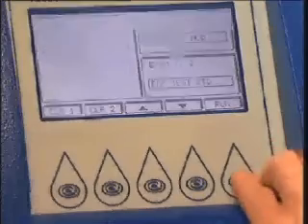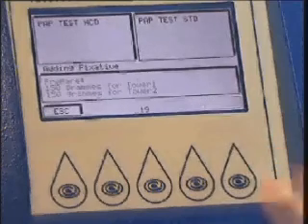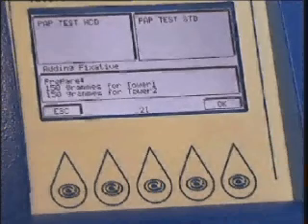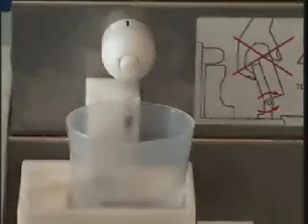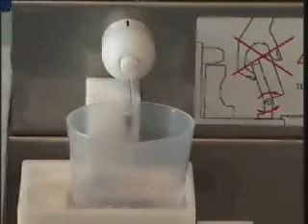The sample vials are poured into the funnels and the processor is started. Before starting the vacuum aspiration, a special fixative is automatically added.